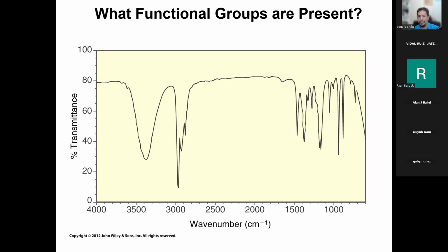Okay, so hydroxyl, CH stretch, okay. Perfect. Excellent. Broad peak at 3,500-ish from a hydroxyl. Excellent. It's not exactly at 3500. It's a little lower than that, right? Look at the highest point and come a little lower. It's like a 3400, but in general, it's broad. It starts at around 3200 and it goes up to around 3600, right?